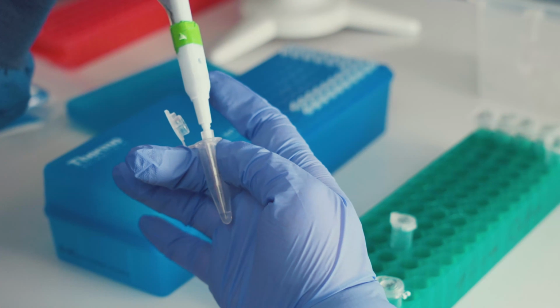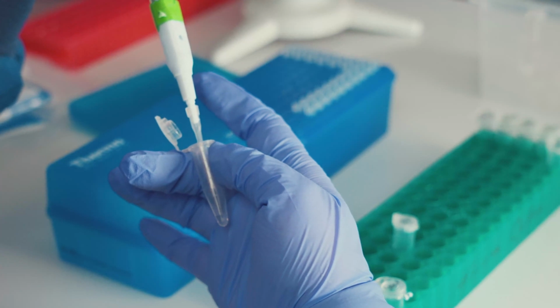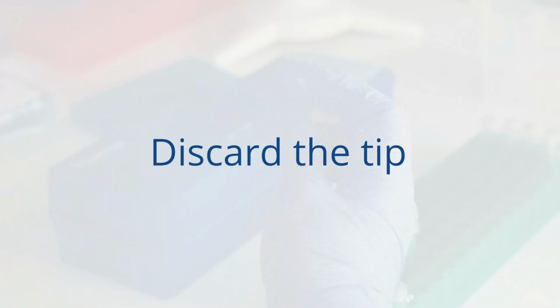Pipette up and down a couple times. Prior to exiting the tube, you want to make sure that the pipette tip is completely empty. Once the pipette tip comes out of the tube, you can close the tube and discard the pipette tip.